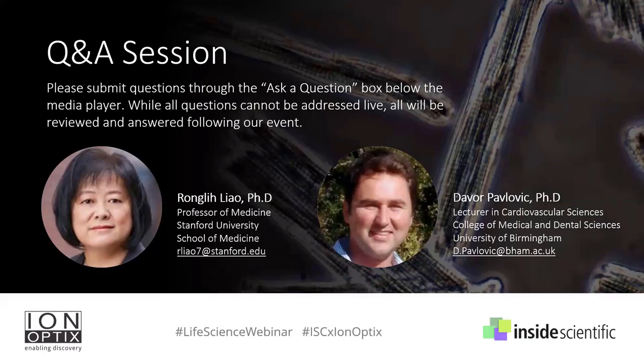Perfect. And Davor, do you have anything to add to that? No, I think that's a great answer, and I fully agree. The only thing I would add is that underdigestion and overdigestion are clearly two different sides of the spectrum. But actually, for different techniques, they are equally important.